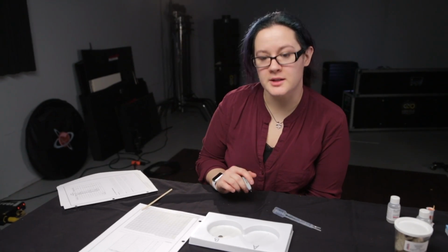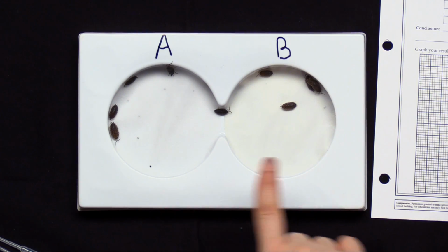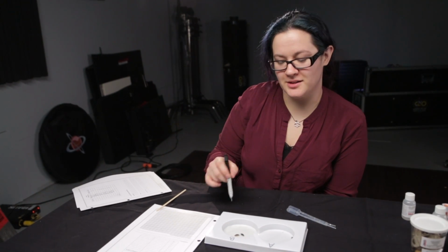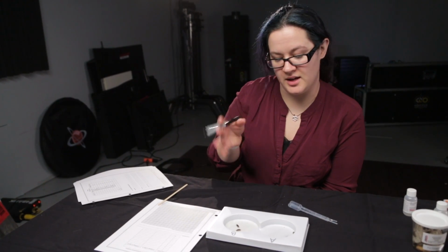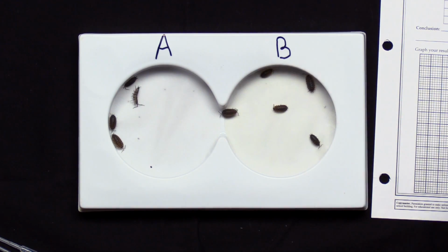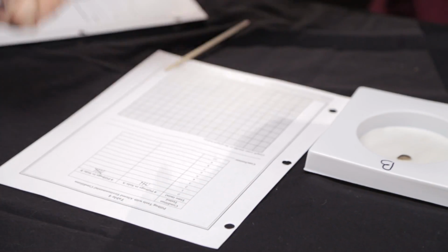All right, so we're going to start the experiment again, and this is actually kind of easy. I happen to have A for acid and B for base. It's like I planned it that way. And we are going to monitor and see how many pill bugs are in each. So we'll take this as our initial measurement. I see 5 and 5, and that's a pretty good start. So I will mark that down.